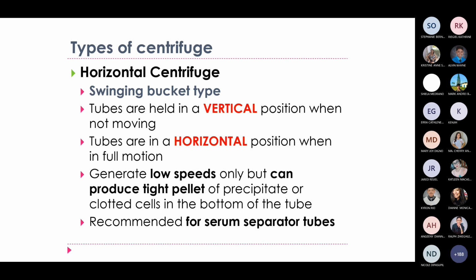Ano daw ang itsura ni tubes kapag hindi gumagalaw or hindi na-operate si centrifuge? Naka-vertical position. And kapag in full motion, or nagsiswing na siya, naka-horizontal position naman siya.